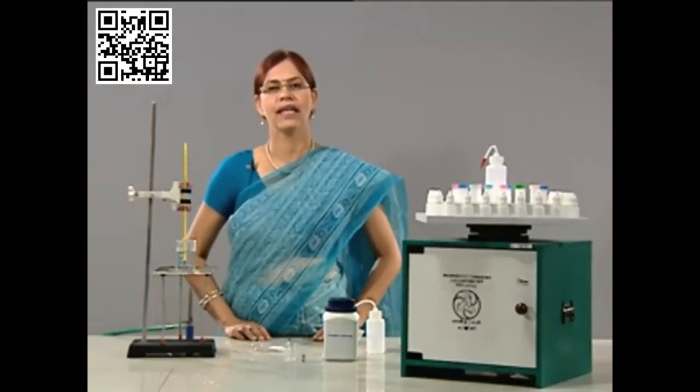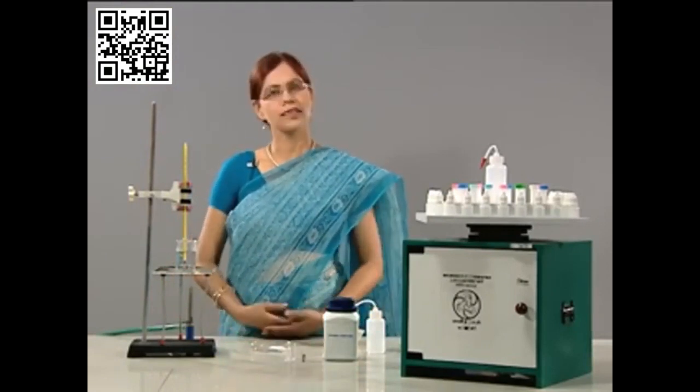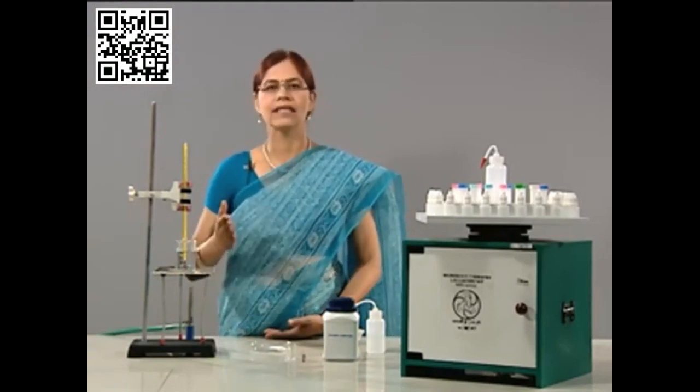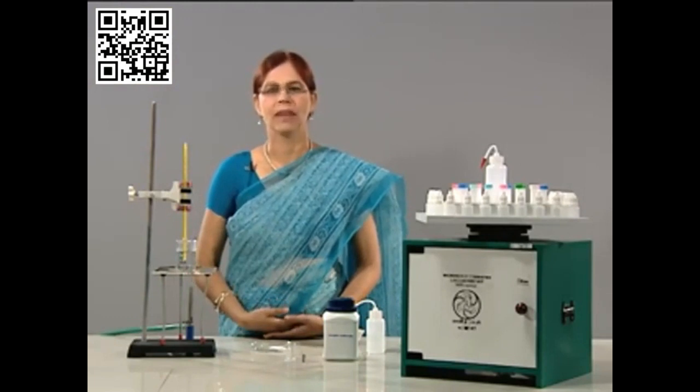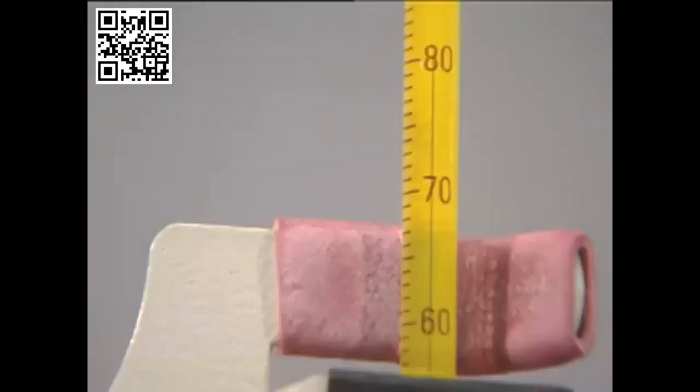Now we can define melting point. It is the temperature at which the substance changes from solid state to liquid state at 1 atmospheric pressure. So we infer that the melting point of given organic compound is 80 degrees Celsius.